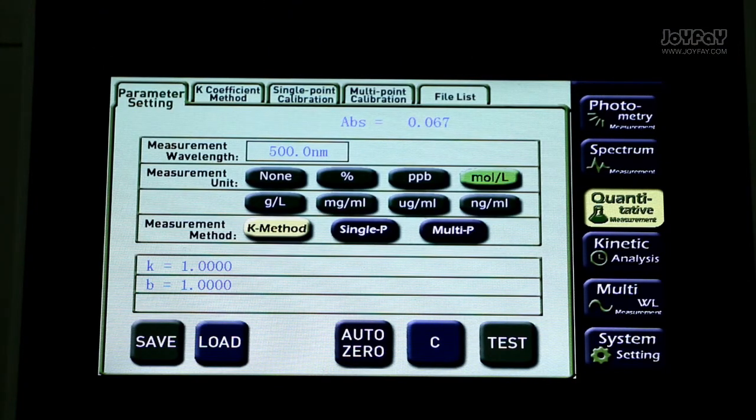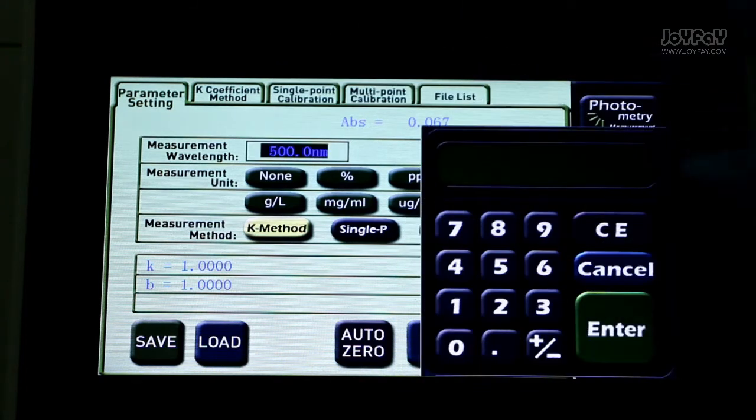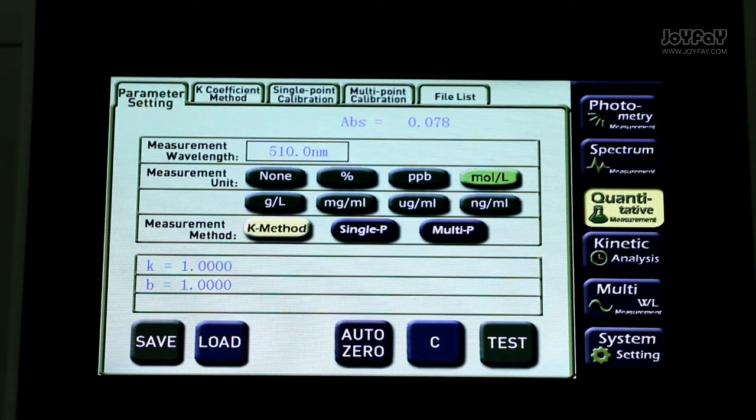The instrument will automatically set the wavelength to the value in any way.